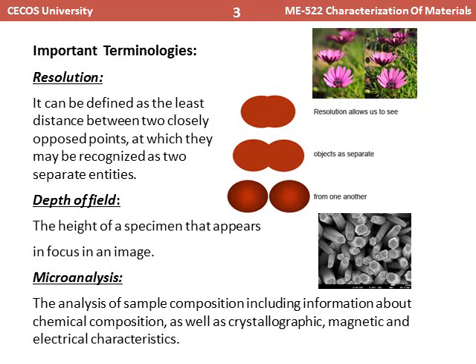Similarly, there is another terminology we will be using in scanning electron microscopy. It's called microanalysis. Microanalysis means that you can know the chemical composition and the arrangement of different atoms or molecules inside the structure.